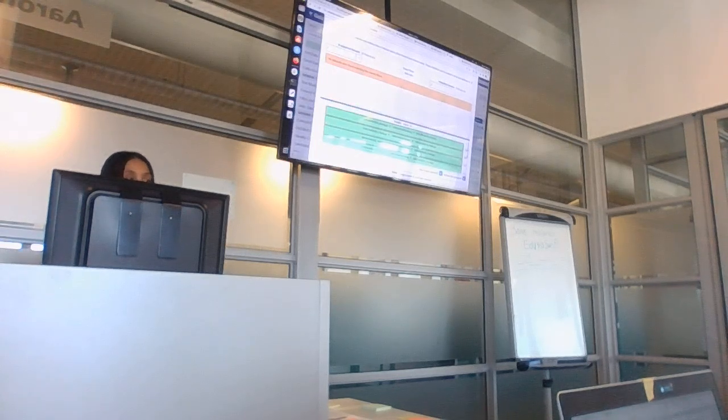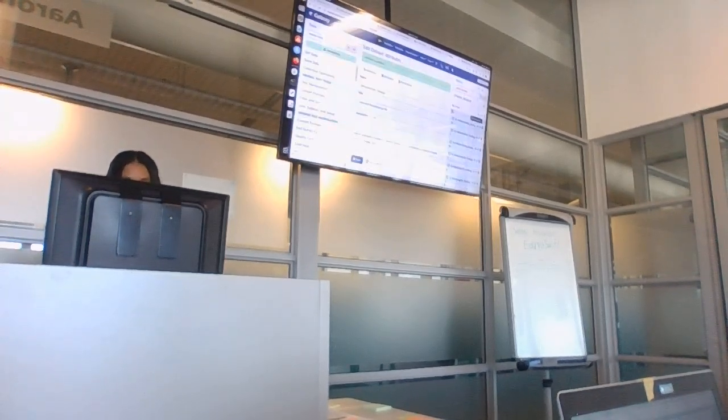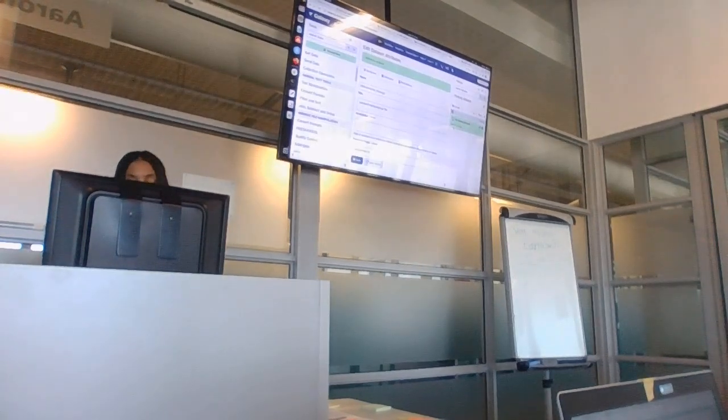Now all of your forward and reverse reads are paired, but your dataset is not created yet. You will have to scroll down to the bottom and enter a name. So maybe call it a dataset. You can leave the others and create collection. And this will now create a collection. It says 8 pairs, and again you can click on it to open it up to see what's inside.